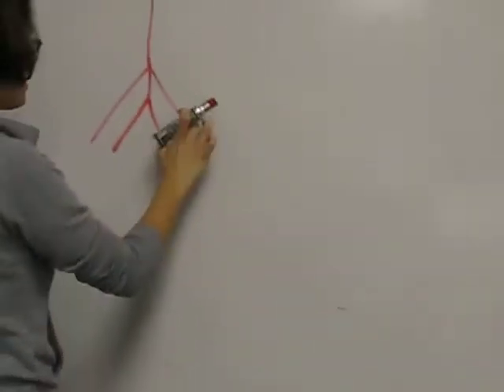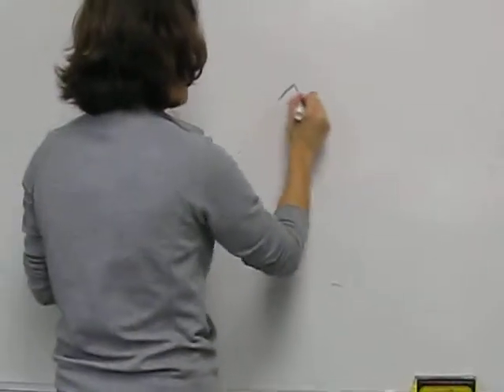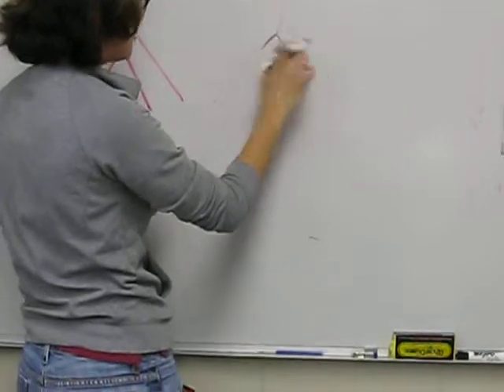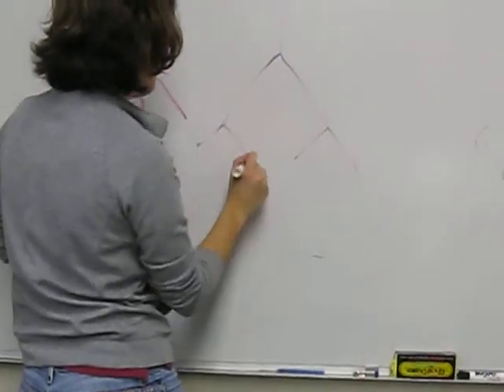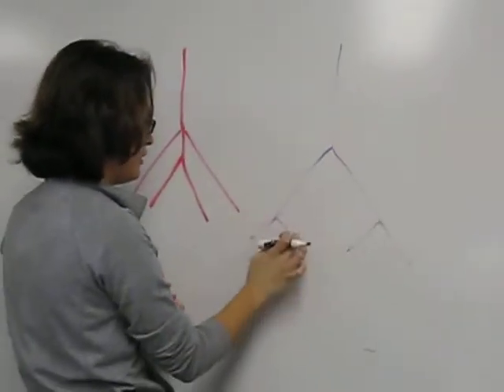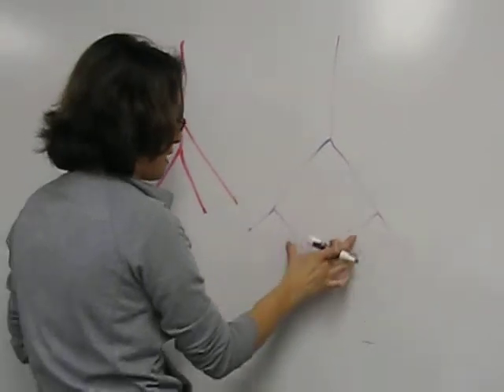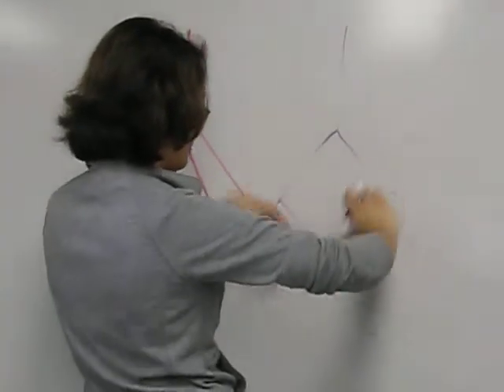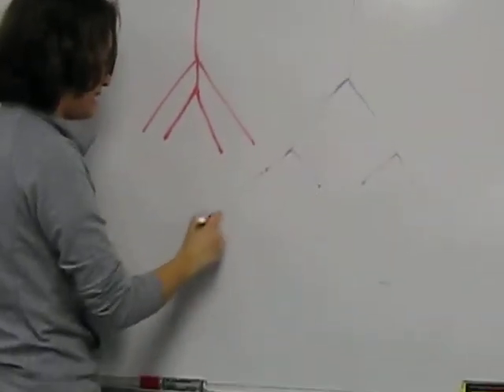So for the iliac arteries, we had this setup, where we had external and internal, left and right iliac arteries. In the cat, it's a little bit different. First, you're going to have a common iliac artery, vein, and then it's going to branch off like this. And that's going to be external and internal. External and internal iliac. Okay. And the externals just kind of go down and more medial. And then once this gets past the leg, into the leg, that's femoral.